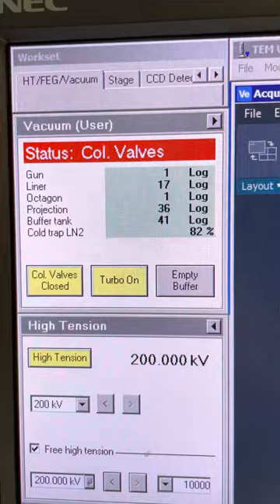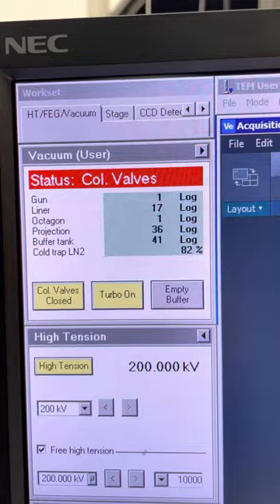And you see here, column valves, the column valves closed button is yellow, which means the column valves are closed.